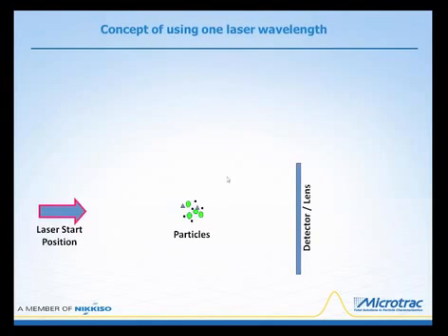Now, one of the things that has always been desired since really the 70s, when we introduced the original Microtrac back in '74, was to extend the range of that original instrument, which started around 2 microns. There was always a desire to get into the submicron region. So one of the ways we could do this is just using lasers rather than bandpass filters.